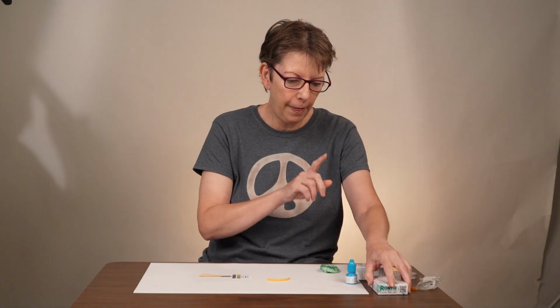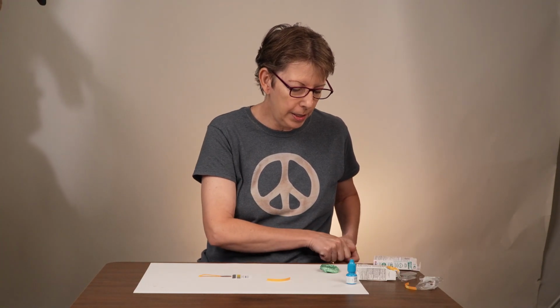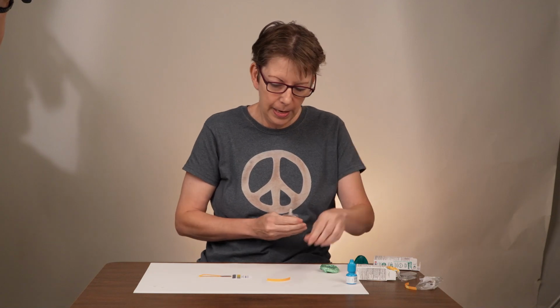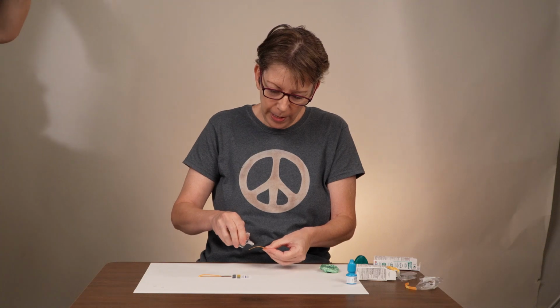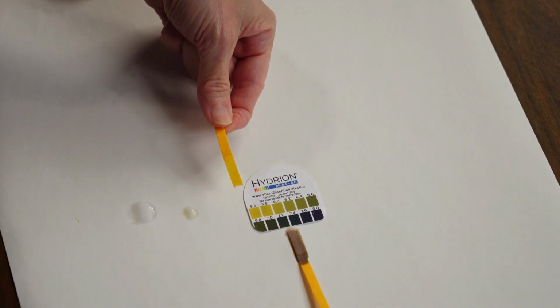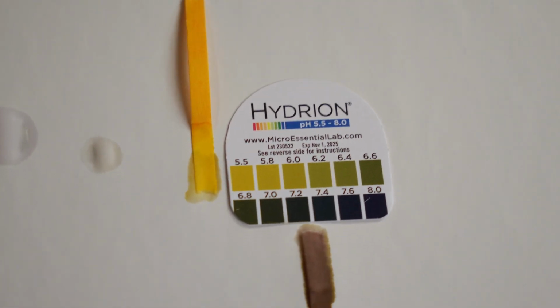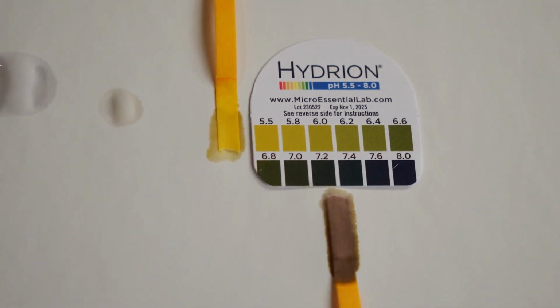So how about the other product? Very frequently recommended, Get the Red Out eye drop, cute childproof cap. I'm going to try to hide the name from you. Okay. And we're going to flood that. Wow. Ouch. Look at that. pH of 5.5.